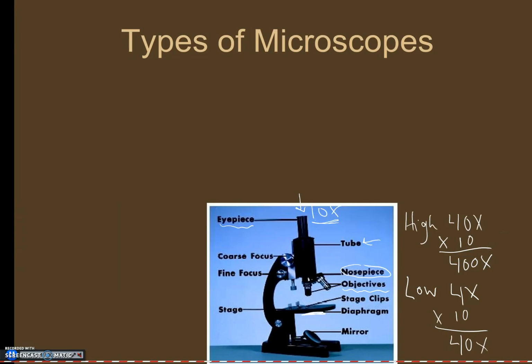When you are focusing the specimen, like I said, you'll start with the low power objective, and then you'll use the coarse focus to find it in place. And the coarse focus, or the coarse adjustment wheel, it's the same. It's going to be the larger of the two adjustment wheels, and it's called coarse because it is kind of a rough adjustment. It does move the body tube up and down quite significantly. You can actually see it. And then you would use the fine focus to fine tune what it is that you're looking at to show it in greater detail.